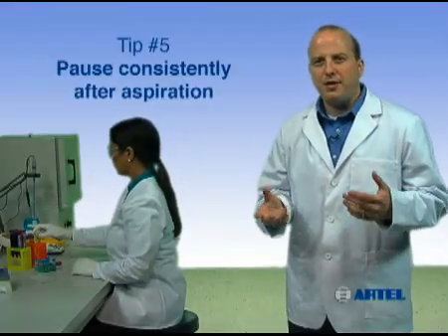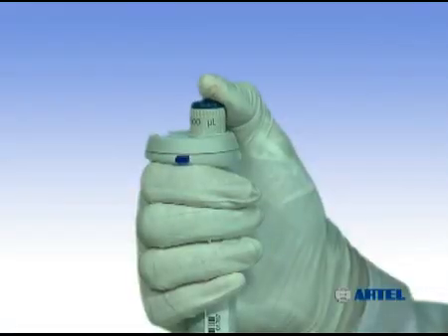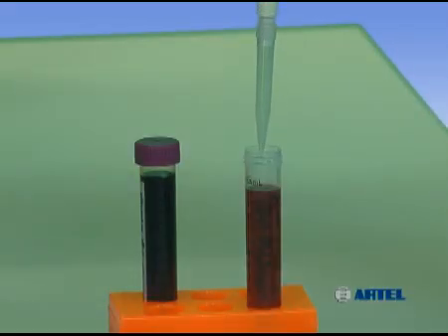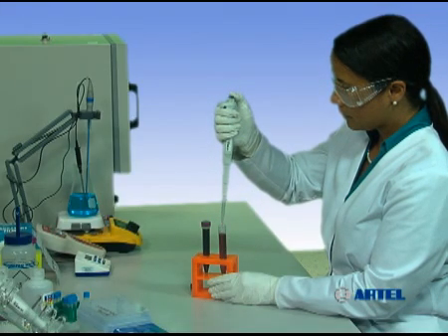After aspiration, the amount of liquid in the tip can bounce slightly when the plunger stops. Slow, even plunger release and a consistent brief pause after aspiration minimizes errors resulting from this phenomenon. After releasing the plunger with the tip still in the sample, it can be good practice to pause one to two seconds, which will give the liquid and the pressure inside the tip time to stabilize. A pause step such as this can be especially important when working with viscous solutions.